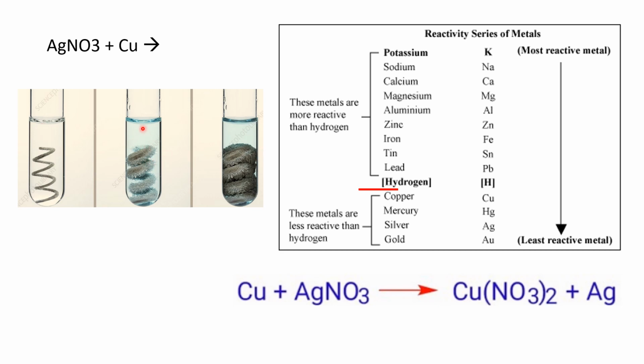Okay, take note, the color of the solution is becoming blue. Nag-darker blue color siya as you proceed from left to right. Nagiging more intense yung blue color ng solution because that is copper becoming copper nitrate. Copper nitrate is soluble in water.